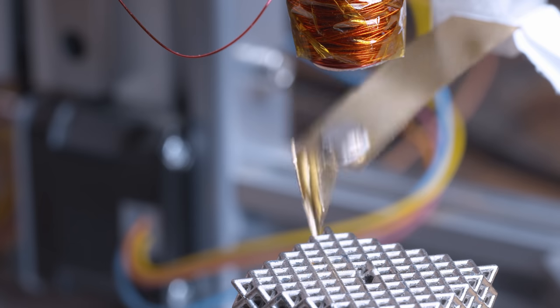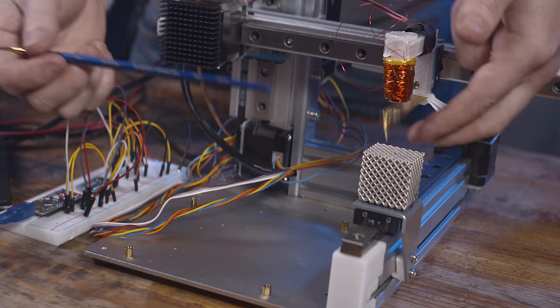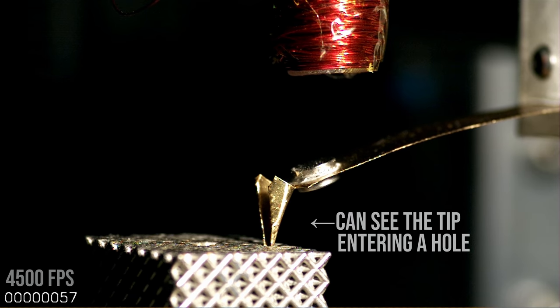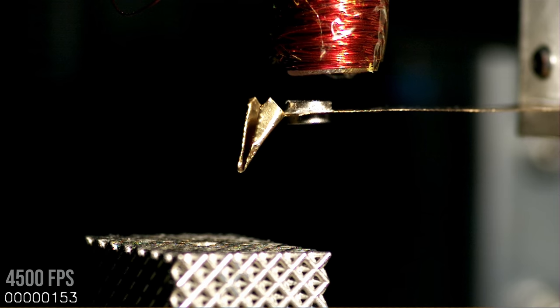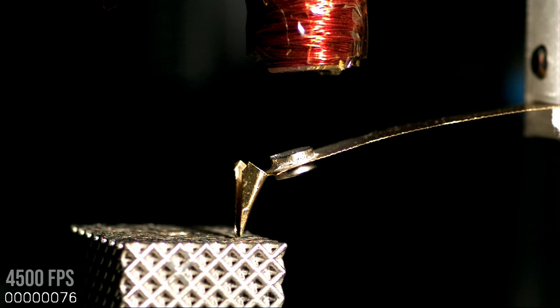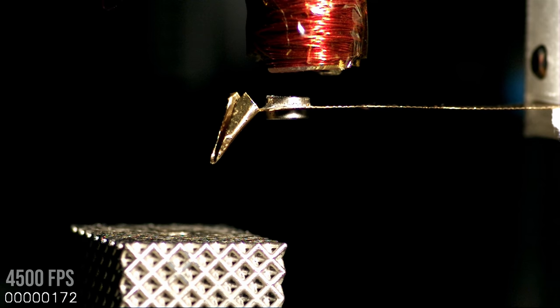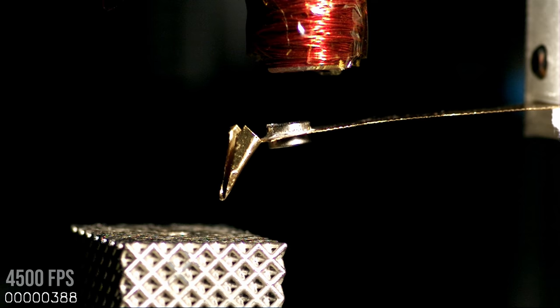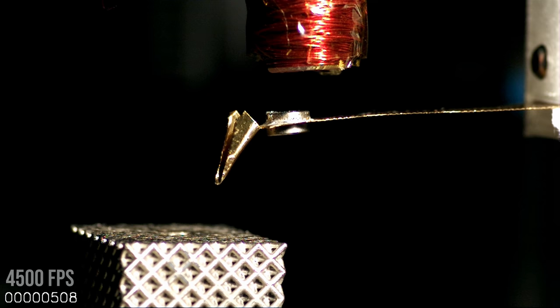There are some interesting things to note about a scanning probe technique. The tip directly impacts what you can actually scan — I tried to make the tip as sharp and tall as possible. The wider the tip, the more likely you are to hit side features, so as it goes into a hole with a really wide tip you're likely to hit the edges rather than the bottom. The geometry of the tip is very important. Also, because this is a cantilever fixed at one end, it's impacting the surface at an angle going through an arc, which has impacts on what geometries you can scan and how they are resolved.